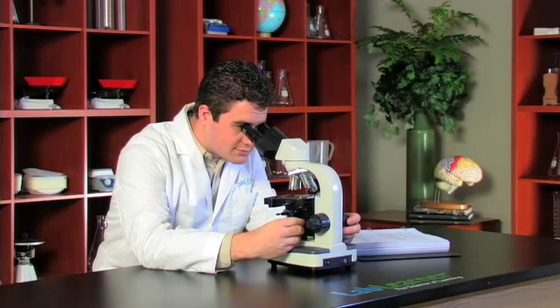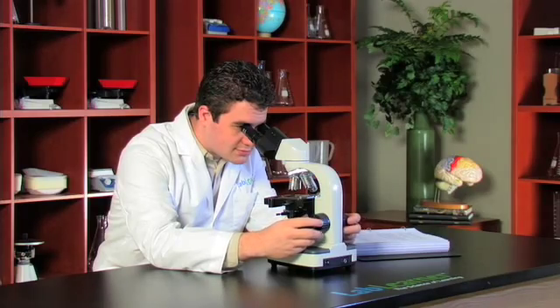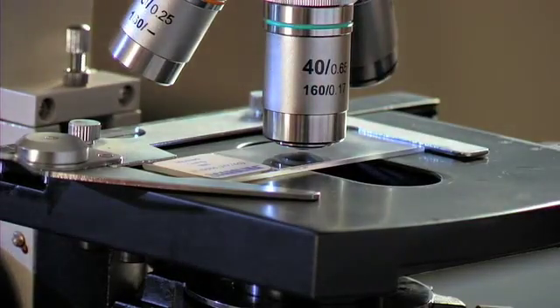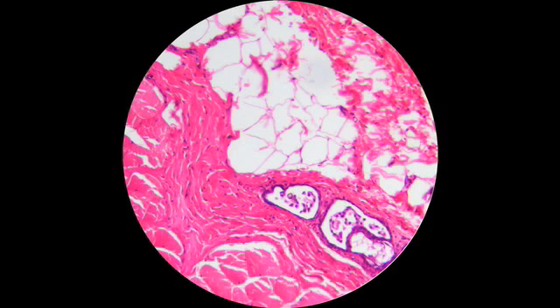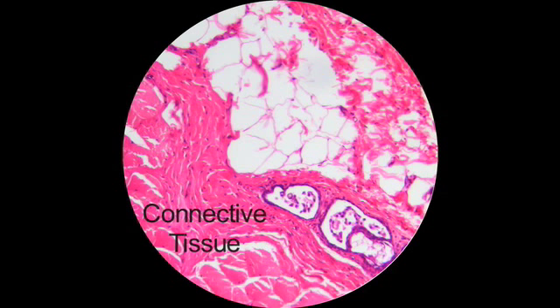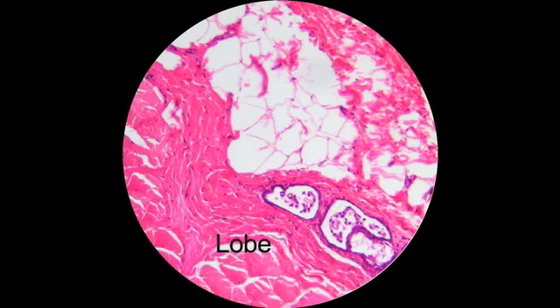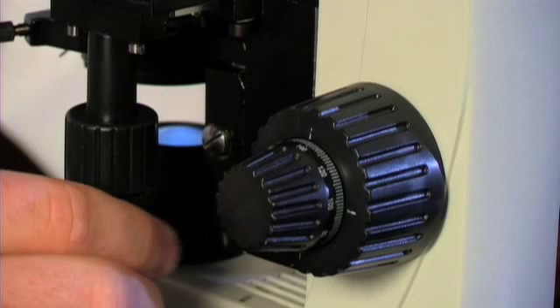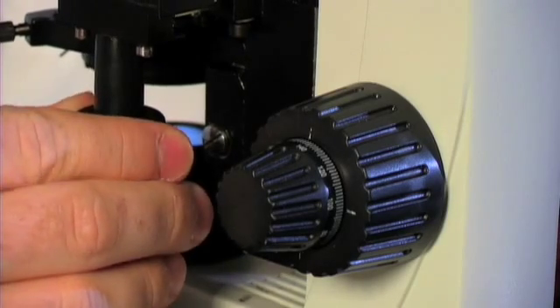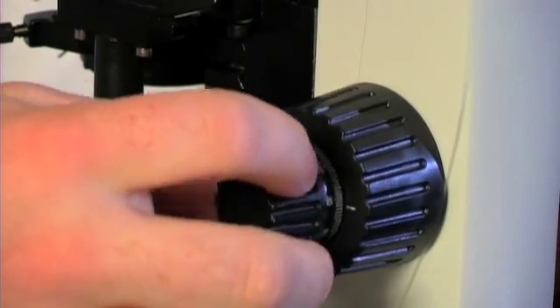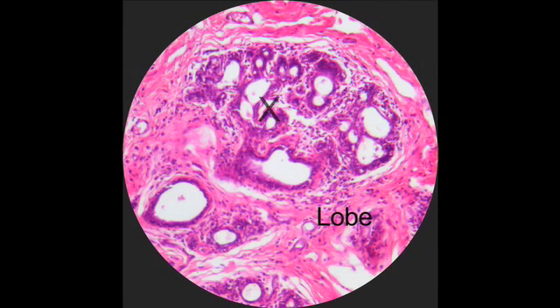We switch to a higher magnification for a good view. Much of what we see is connective tissue, stained pink in this section. In addition to the connective tissue, we also have adipose cells, or fat cells, shown with the X — we saw that in the skin as well. A very important structure are the lobes, which you see here stained in a purple color. You're not going to find many lobes in inactive breast tissue. However, if we translocate over to the active breast tissue section on the same slide, we'll see a great deal of lobe tissue, indicating that a large amount of milk is being created.